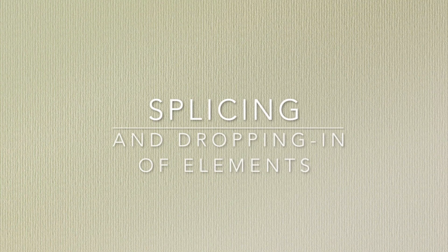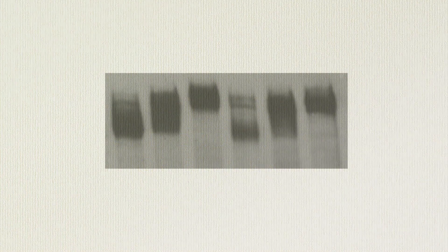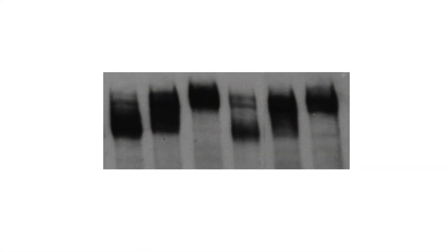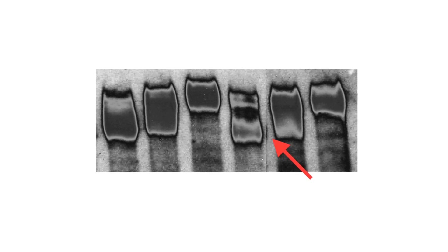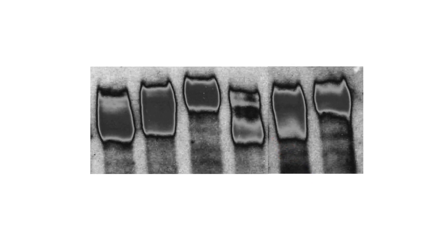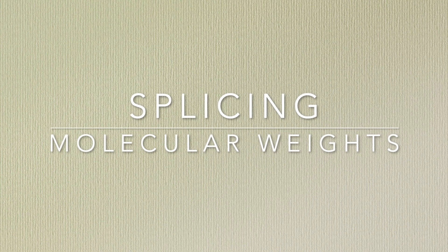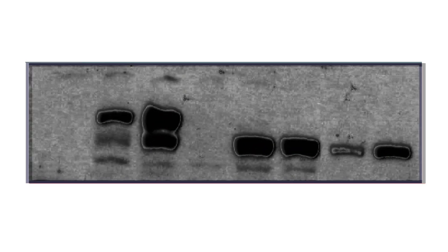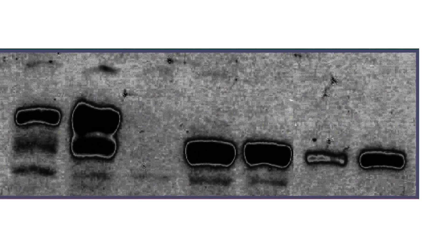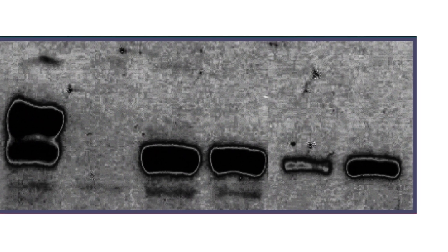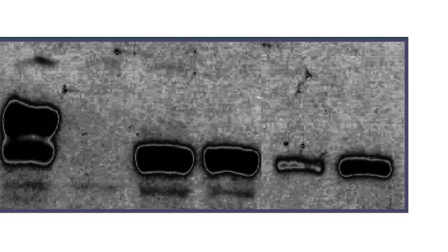Looking more closely at individual blot panels, you may detect vertical or horizontal hard straight lines where the background appears interrupted. These are generally digital cuts where an image section was either inserted or removed. Splice marks are often more easily detected in solarized images. If you do detect any potential splice marks, you should ask for raw data to trace exactly where the cuts were made and why. It is acceptable to juxtapose lanes that weren't adjacent in the gel, as long as the cut is declared and clearly marked.